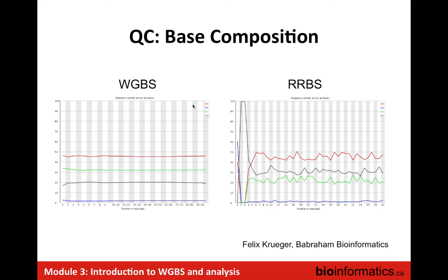data. In the context of RRBS, the profile also looks quite different because of the properties of the initial enrichment and the cutting. But again, you'll have to look at a few of these to see what it looks like. The key is really to also make sure that all of your samples have a similar profile. So that's one important thing to look at even before doing the processing itself.